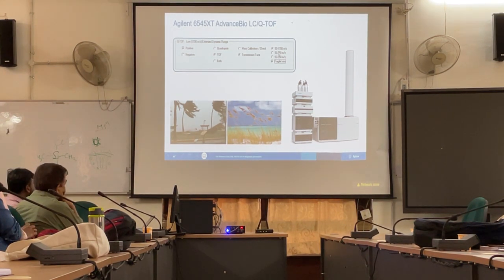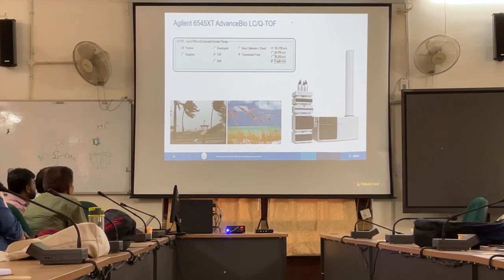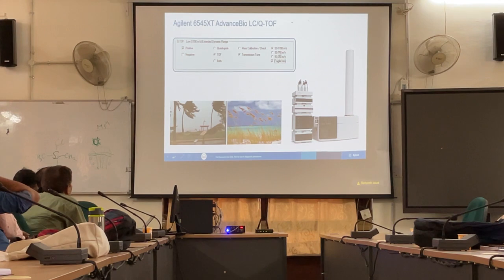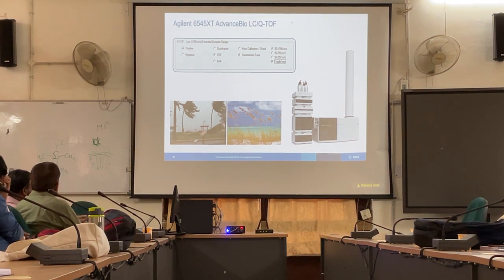This is a tool, where I mentioned different mass ranges in the instrument. Now, 3200 m/z is our mass range for peptides. That is our standard mass range. In small molecules, we have 50 to 1700. Apart from that, we have 50 to 750 and 50 to 250, which are more targeted towards the mass range you are looking for. So if you are looking for metabolites, you will be looking at the range of 50 to 750. So this is a very targeted tuning. Earlier people used to do manual tuning. At least we used to, in the initial days.